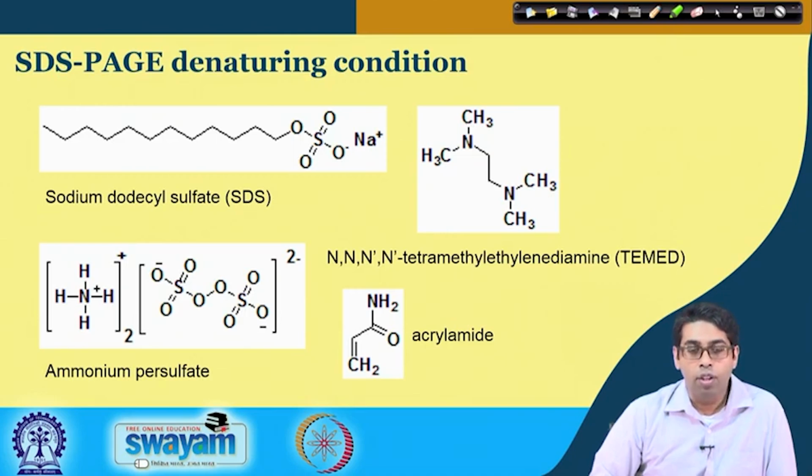In that case, the only option will be to pour out the solution mixture from between the glass plates, but remember that unpolymerized acrylamide is harmful. So, you should not dump that into the lab sink. What you should do is take it out in a beaker, add some ammonium persulfate and TEMED, let it polymerize, and then you can scrape it out and dispose of it.